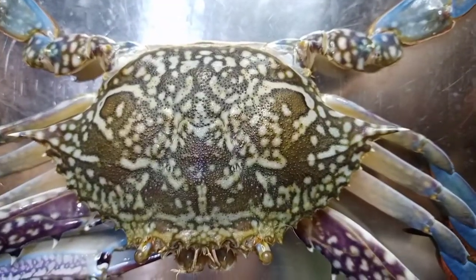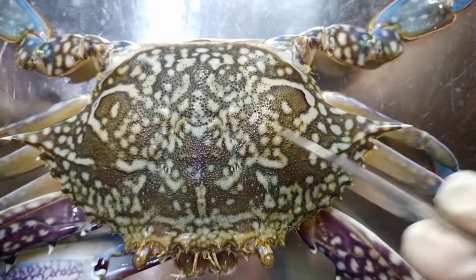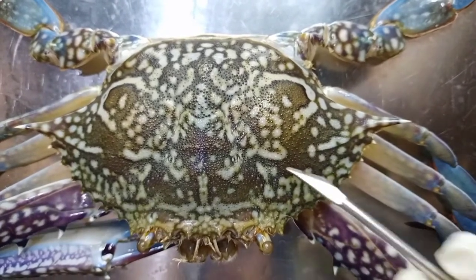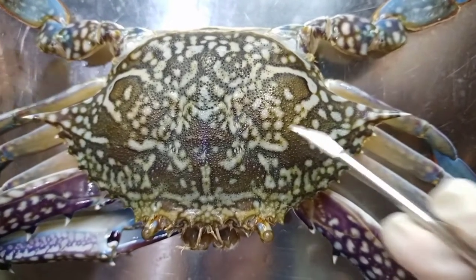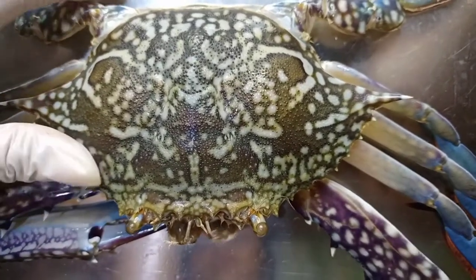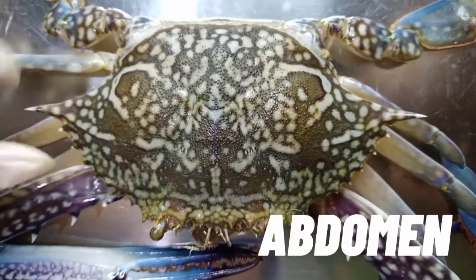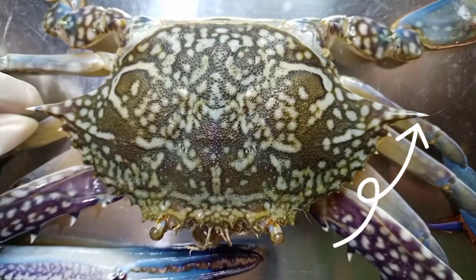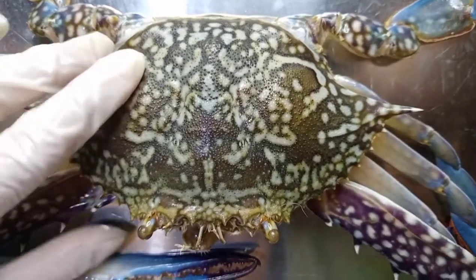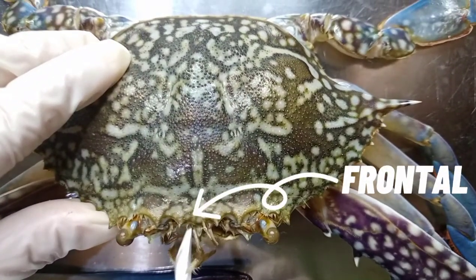Now we'll identify and examine the external and internal anatomy of the blue crab. Let's first start on the dorsal side. This is the carapace — a hard upper shell that covers and protects the head and the thorax. Here in the posterior end, we can see the folded abdomen. Here we can see the lateral spine, these two structures here, and between the eyes is the frontal spine.